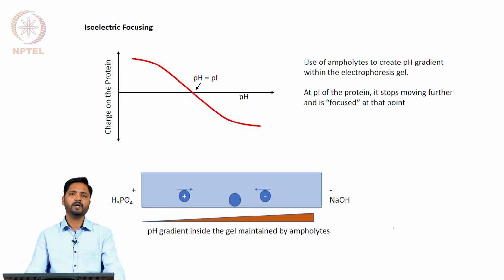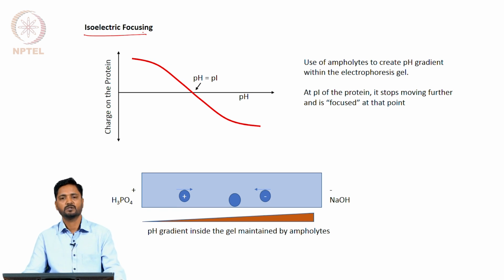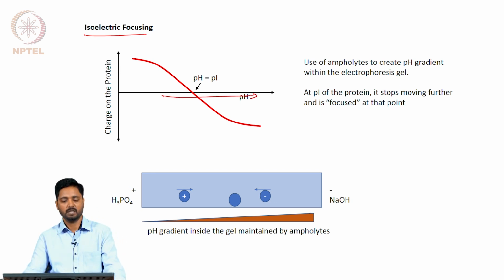The last topic of this lecture will deal with what is known as isoelectric focusing. As the term indicates here, we are trying to focus our charged particle at a particular location within the gel, and this is based on the concept of the change in the charge of the protein or the particle as the pH of the medium is altered.